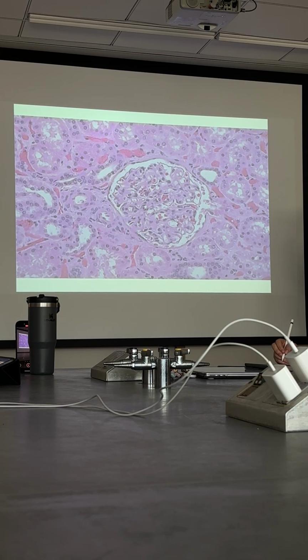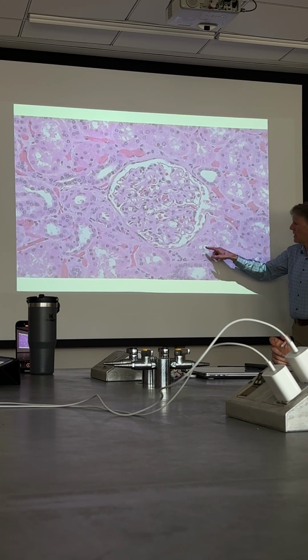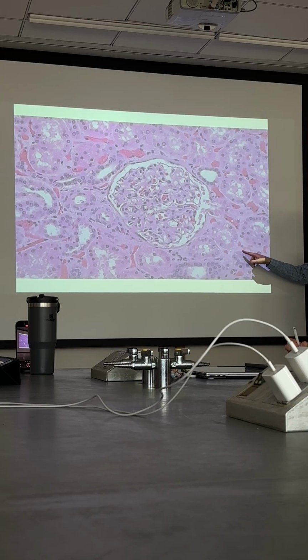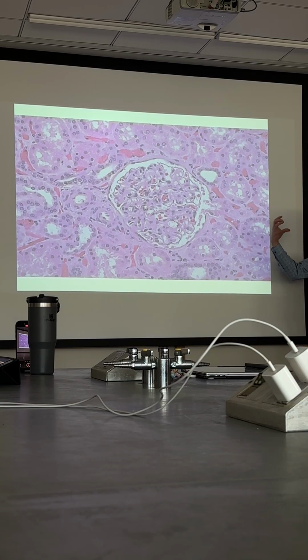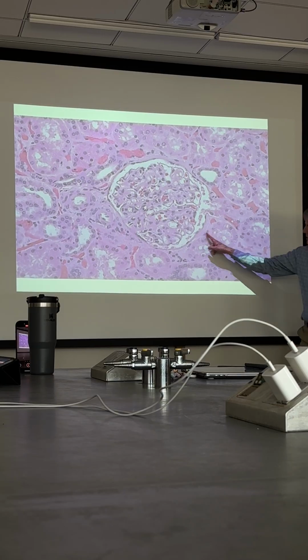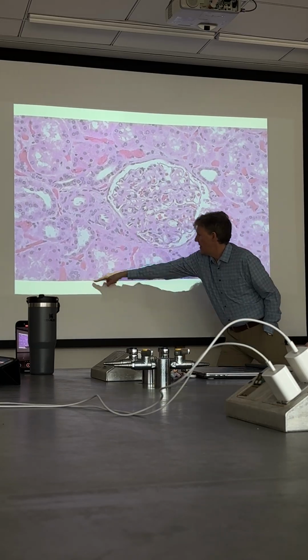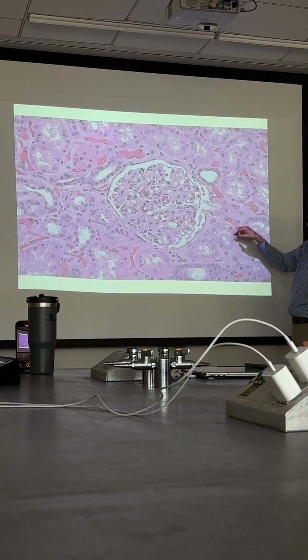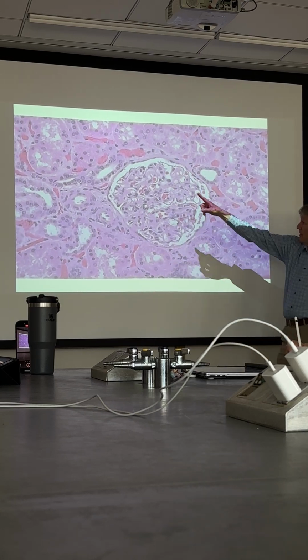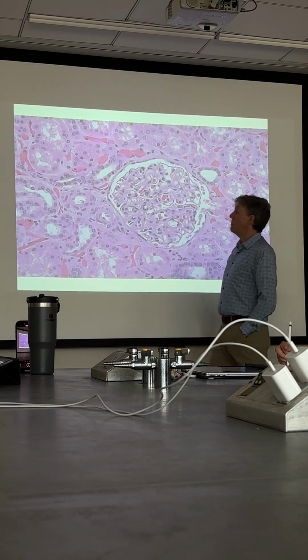So if the lumen looks kind of cloudy on the inside, and if you have these light purple, pinkish, big frothy looking cells, that's going to be proximal convoluted tubule. So this, probably that, this up there, that up there, that's all going to be like those guys over there. That's all going to be PCT.